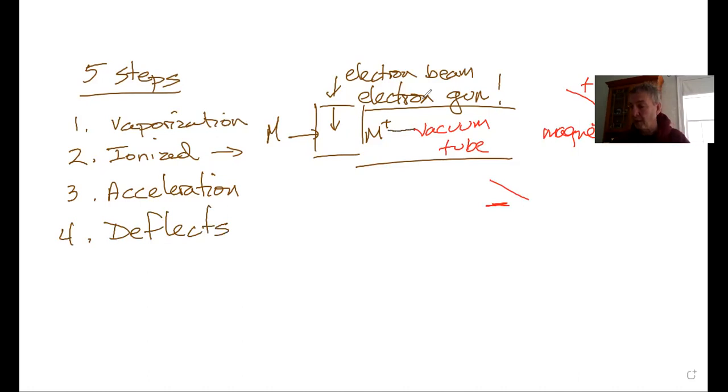So the particle M comes down here and it deflects through a magnet. Now, why is that important? Well, the reason that is important is like if you're in a small car and you take a sharp turn, it's not so bad, right? But if you're in a big car or a truck, that is a much more difficult assignment.